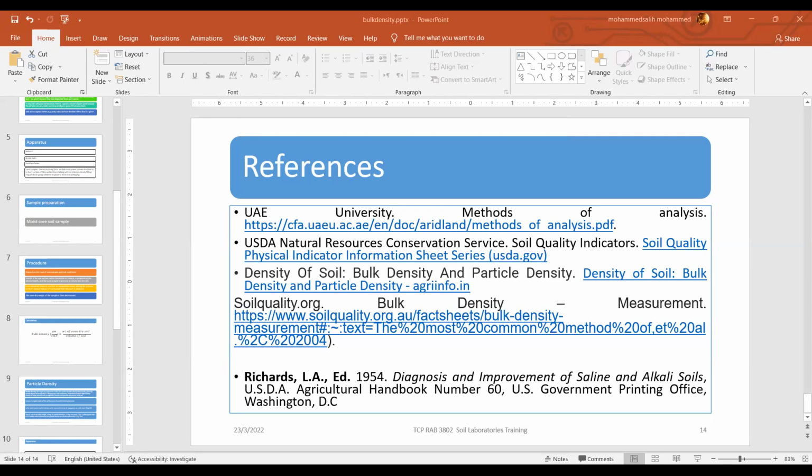The floor is yours now, and we can discuss a little about this. The good news is that Clary prepared something, what we described yesterday about the rapid methodology of determining particle density.